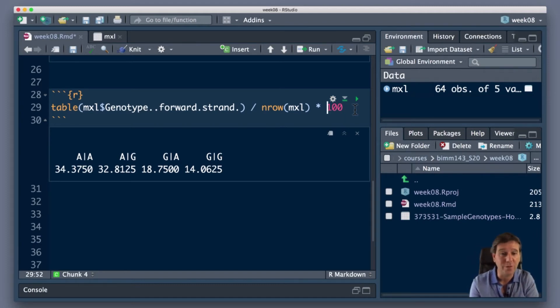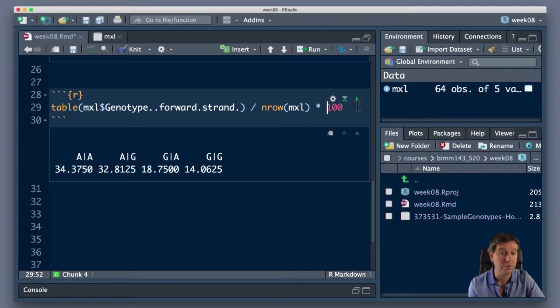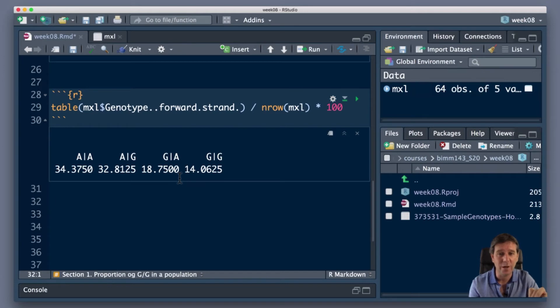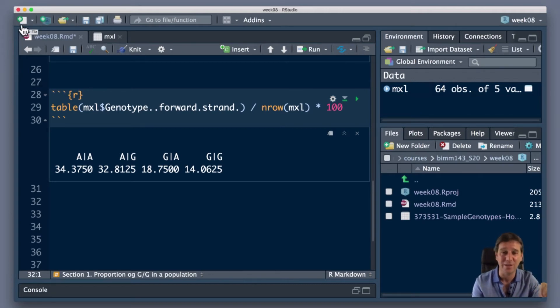Let's go and compare it to another population. This isn't in the workbook, but let's do it for comparison. Let's go to that British population - the GBR population. I'm going to go back and get the data in the same way I did for the Mexican ancestry population - download the file. This is all good practice for getting at bits of data to compute things from. That's the core of using these languages and analysis routines productively - being able to do that.